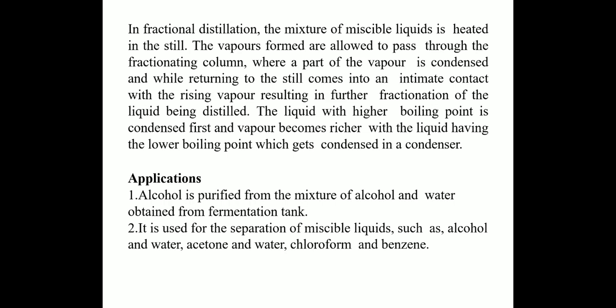Talking about the application, alcohol is purified from the mixture of alcohol and water obtained from the fermentation tank. It is used for the separation of miscible liquids such as alcohol and water, acetone and water, chloroform and benzene.